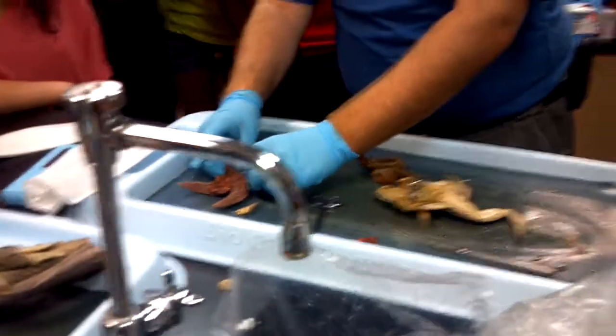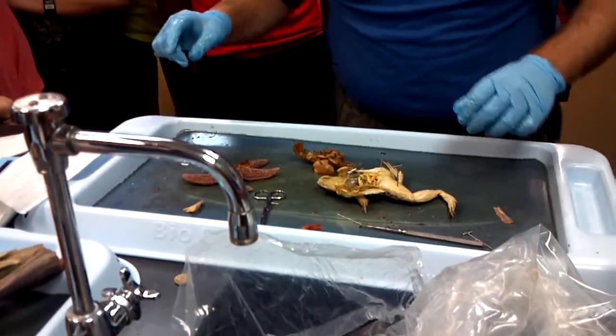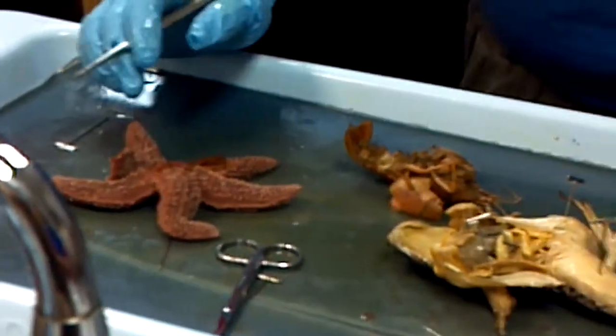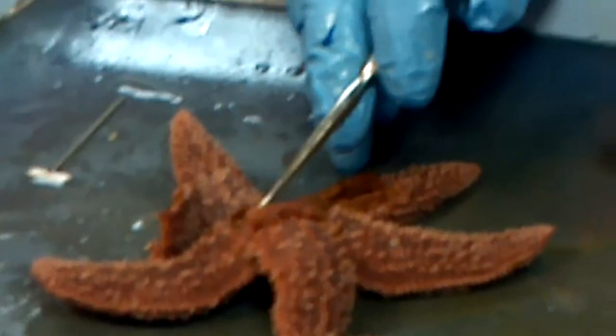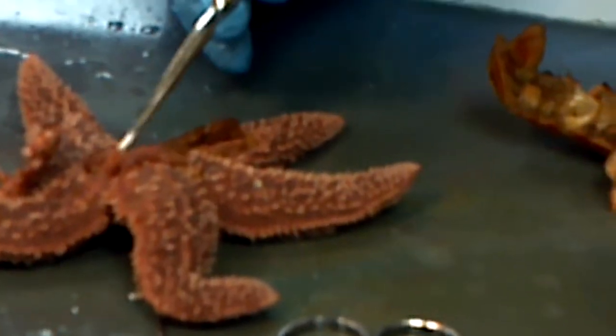Starfish. This starfish really is pretty well intact — I didn't butcher it too badly. We have the two stomachs: pyloric on top, cardiac below. This very thin membrane that I'm holding up is the bottom half of the pyloric stomach. The top half is attached right here, and below it this more meaty, bulky section is the cardiac.